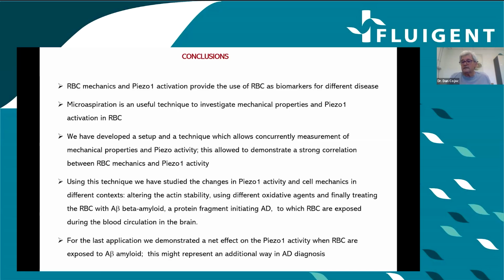And red blood cells bring with them a lot of information on different diseases. Microaspiration is a useful technique to investigate mechanical properties and Piezo1 activation in red blood cells. We have developed a setup and a technique which allows concurrent measurement of mechanical properties and Piezo1 activity, and this allows us to demonstrate a strong correlation between mechanics and Piezo1 activity.